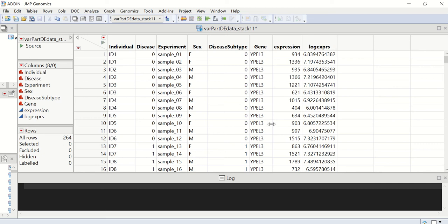For each gene, we can specify a generalized linear mixed model. And for illustration purpose, we are only including 11 genes here in this data table.